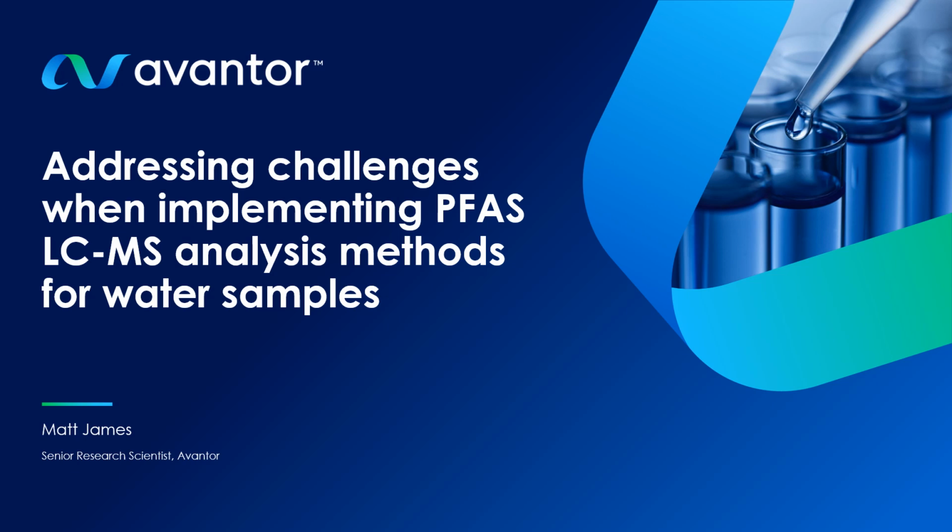As Gemma mentioned, today I'm going to be talking about PFAS analysis by LCMS in water samples. So what I want to discuss is some of the experiences that we have in our own application lab when working with PFAS. As many of you know, they're rather challenging, and whilst we are primarily going to focus on drinking water analysis, much of what I'm going to discuss will be applicable to other types of sample matrices as well.